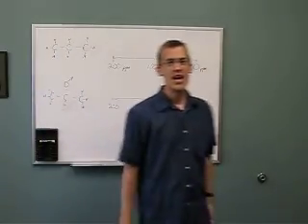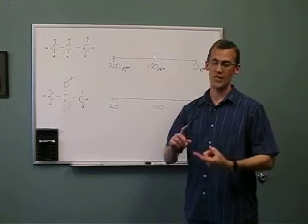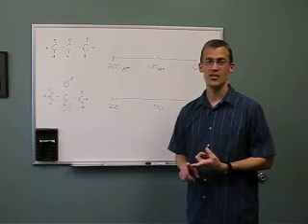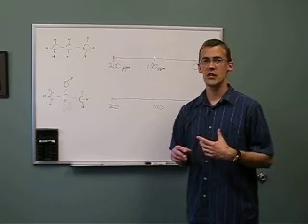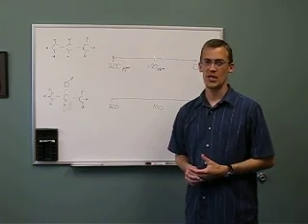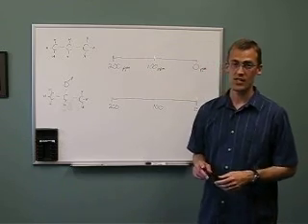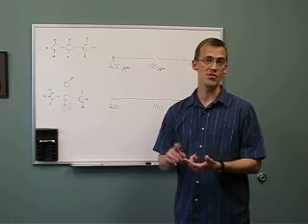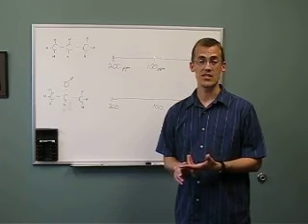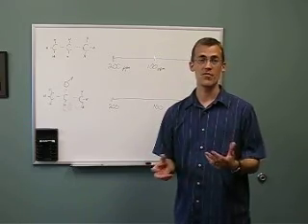Good morning. NMR is a type of spectrophotometer. So we've used visible light absorbance spectrometers already in this lab. And we can use different parts of the electromagnetic spectrum to learn different things about molecules. So the absorbance spectrometers that use visible or UV light, which is sort of what we've done before, have a tendency to explore and quantify compounds with color.